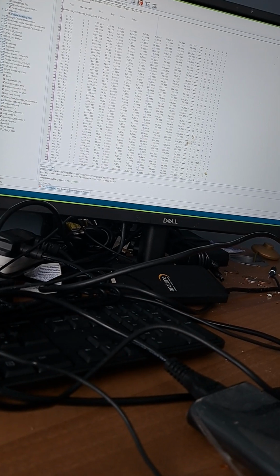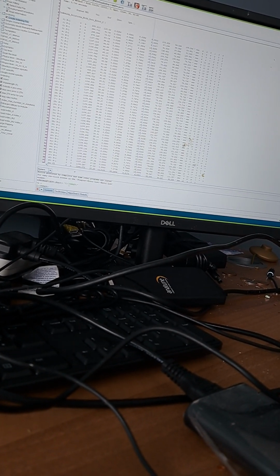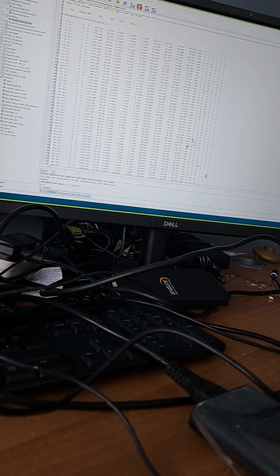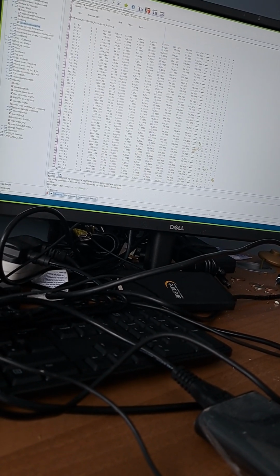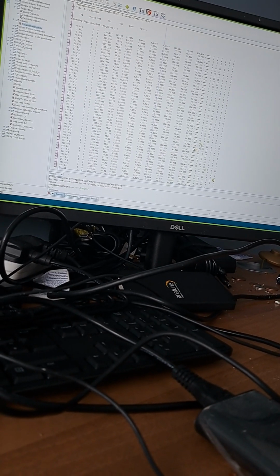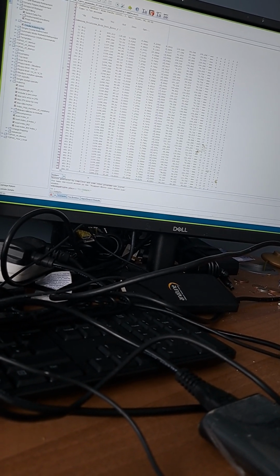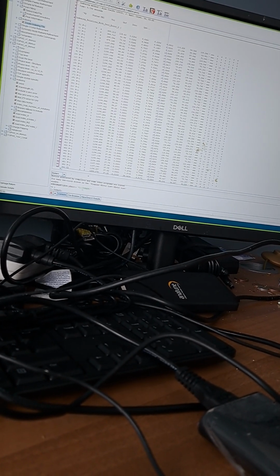Yes. So really, I would strongly suggest that you follow one of these. I think it's hydrochlorothiazide. I think it is an example in DASH. Yes. So with the solution that you have, the unit cell that you have from when we did that, you can input those parameters into DASH. You don't need to index the sample anymore. You can just put in known parameters. Fine. And if you put in those known parameters, then that gets you to the next stage.